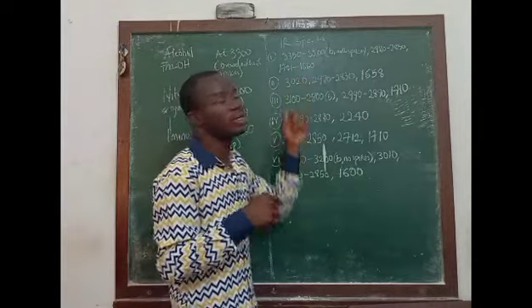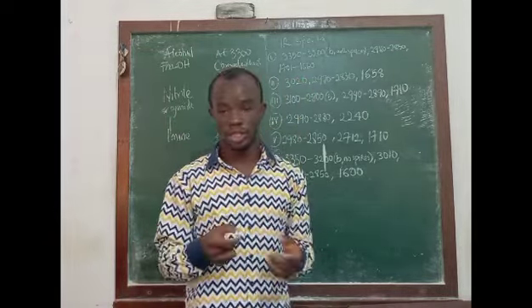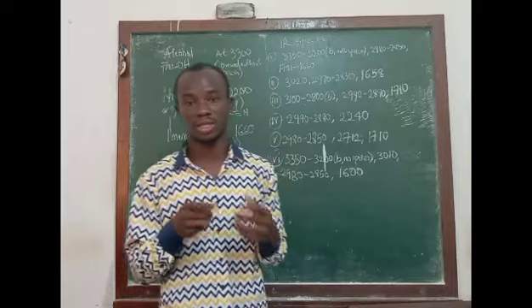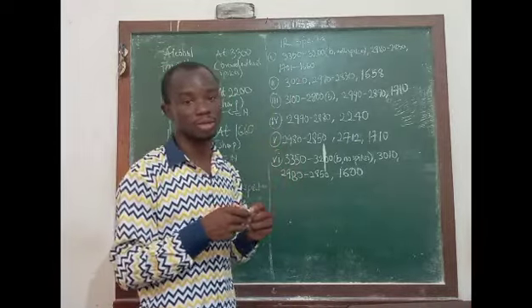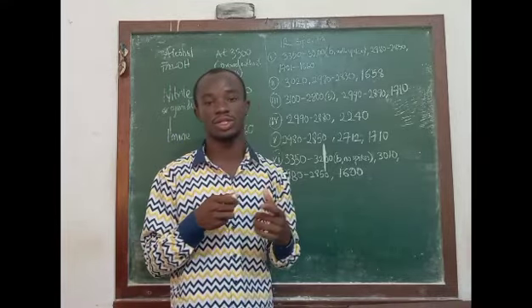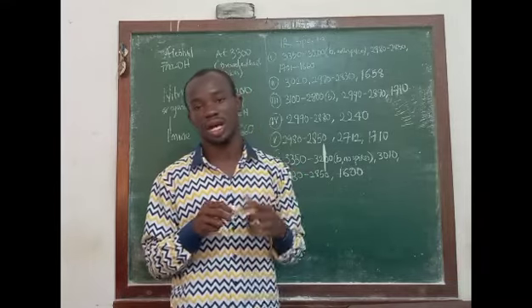So this signal represents your sp2 CH, which you can find in unsaturated compounds such as alkenes and also aromatic compounds. But we also mentioned that if you see a signal just above 3000, you also have to determine whether the sp2 CH is in an aromatic system or whether it is in an alkene.